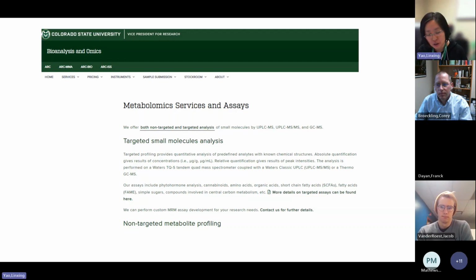For example, ammonium fluoride is not commonly used in the lab because it is a toxic and corrosive compound. But there's an increasing trend that people are finding more and more cases where the ionization of compounds is improved by this additive, but it doesn't work for all compounds.